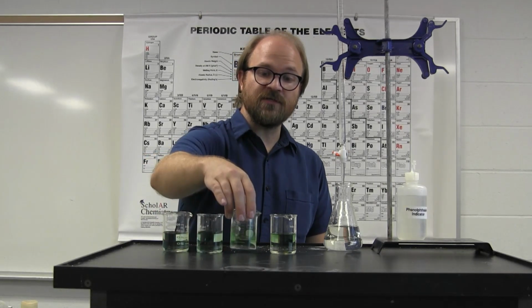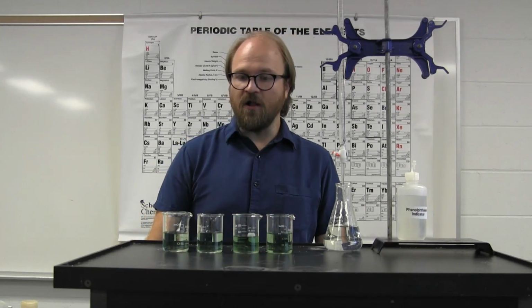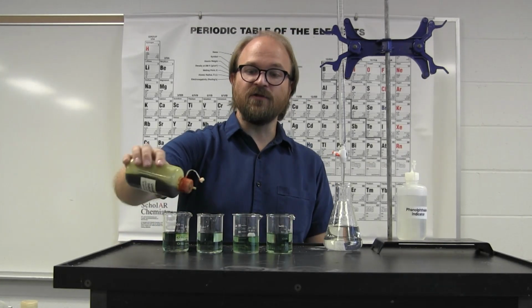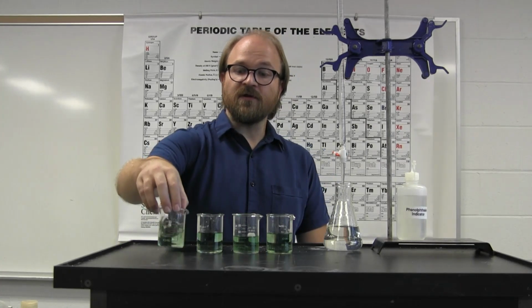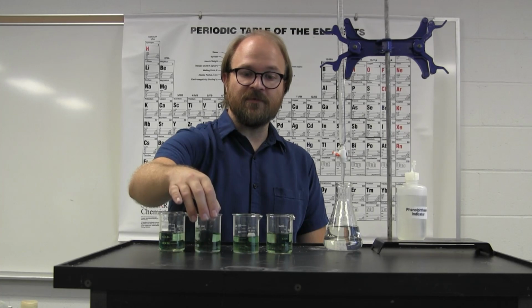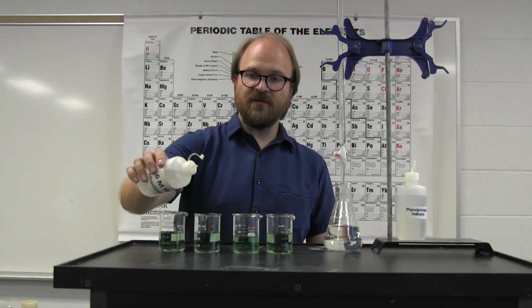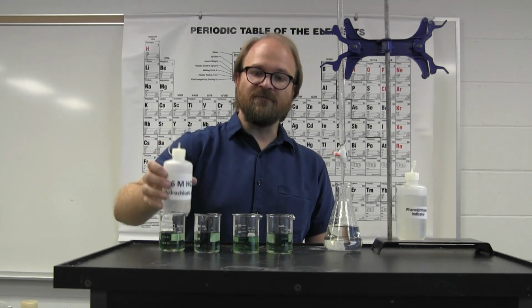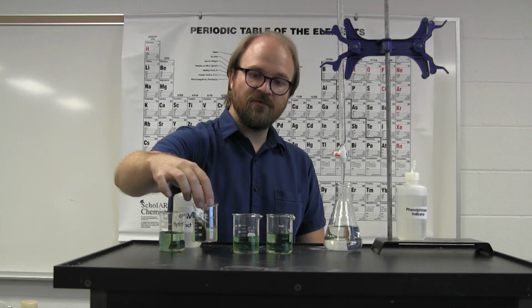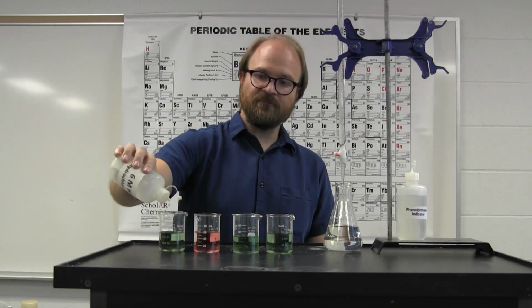These four solutions are all just tap water. They all have a relatively neutral pH and the color is green. However, if I add a small amount of hydrochloric acid, the solution will turn red.